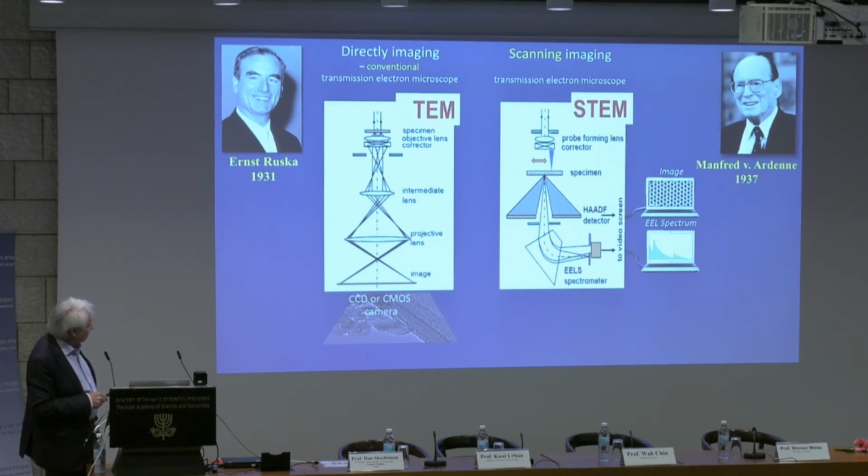And here we have the incoming beam, we have the lenses, and these lenses are forming a very fine, resolution-limiting beam, which is then scanned over the specimen, and the transmitted electrons are caught, registered by a detector down here, and the signal is used to obtain the image.